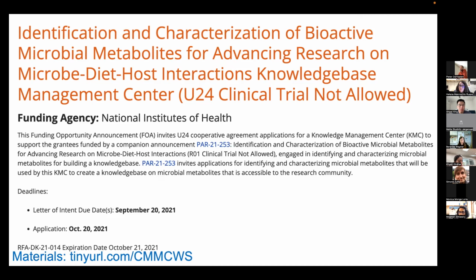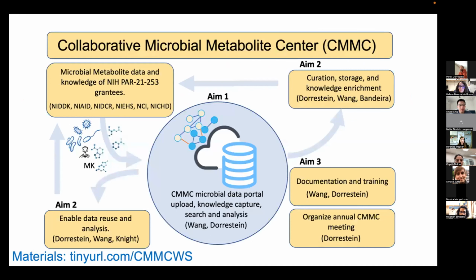And so the tool that you're going to learn about today is the first sort of tool to aggregate microbial metabolite information, as well as a way to use it. The way it essentially operates, and what you're going to learn about, is that we have a microbial metabolite data portal upload system. The last workshop showed some of the enrichments, but today we're also going to provide an example of an enrichment workflow. We're highlighting the kind of interface that we now have for upload.